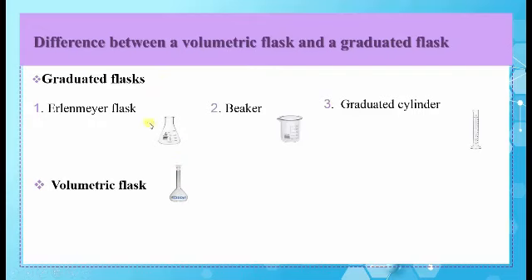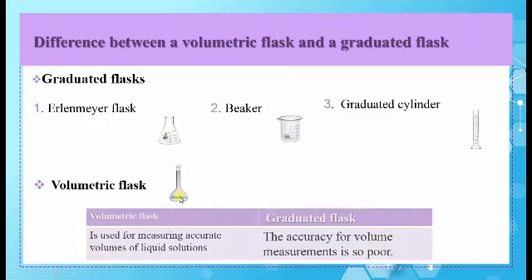About the graduated flask, they have many graduations. But the volumetric flask has one graduation, one volume. So the volumetric flask is used for measuring accurate volumes of liquid solutions, and for the graduated flask, the accuracy for volume measurements is poor.